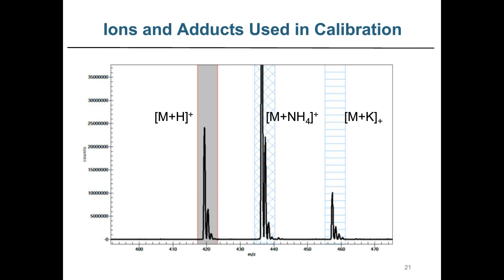Well, first of all, how do we develop a calibration for LCMS? In GCMS, as we noted, it's very convenient. We have a built-in calibration. Some of the LCMS instruments also use standard tune solutions, which we can take advantage of to build a calibration. The other approach is, since we know what the parent drug is, and it's producing a series of ions and adducts over a significant mass range, we can actually use these ions, since we know them, as an internal calibration set. And that's exactly what we're doing in this case.